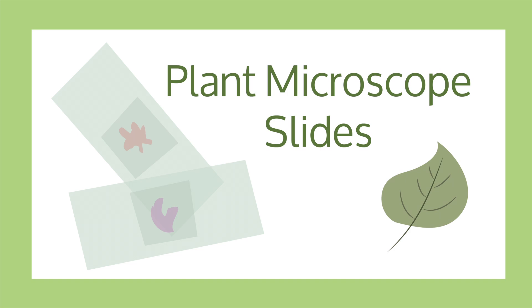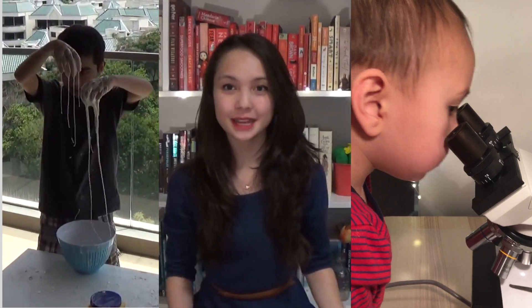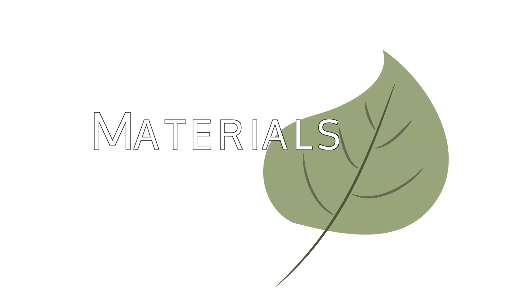Plant microscope slides. Here are the materials you will need.